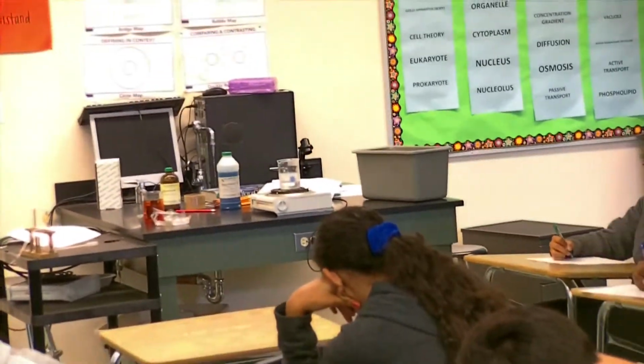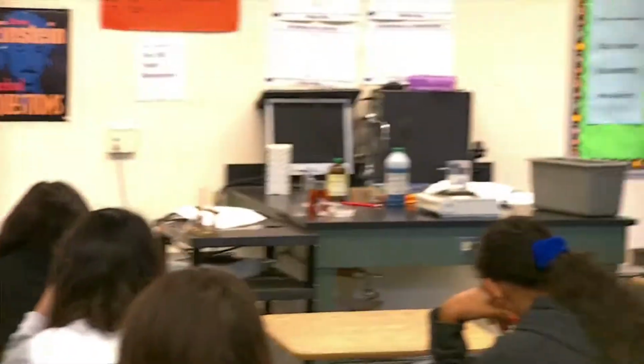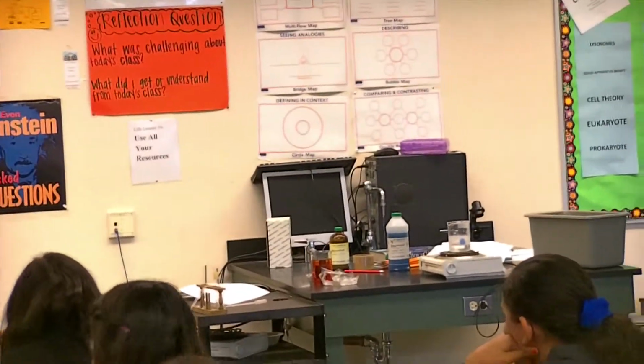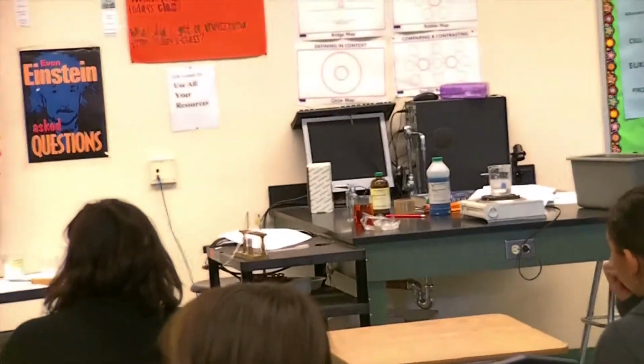This is a complex sugar. It looks a little different from sugar. This is starch, a little bit different. It's not as loose as sugar. Go ahead and describe what it looks like.